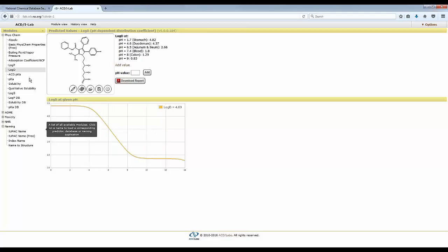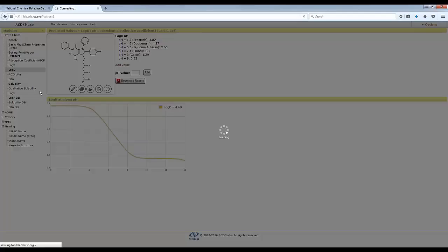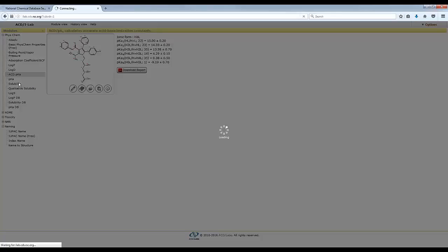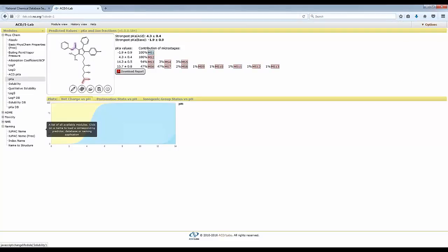And by default, the system comes with these pH values, which are the most common pH values from a biological and pharmaceutical point of view. If, for whatever reason, you want a more accurate number at another pH, you just click here to add a value. And let's say you want, I don't know, pH 9. We click Add. And we see 9 is added there as well. And you have the chart here. And as you move the mouse over the chart, you see the log D value up here changing.